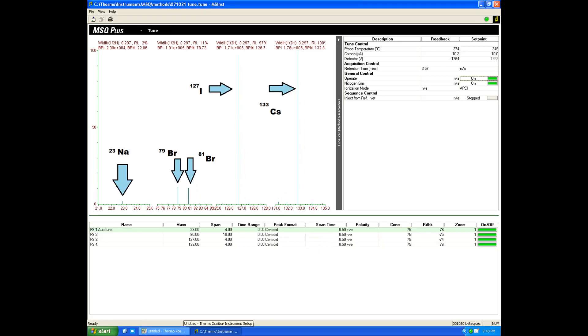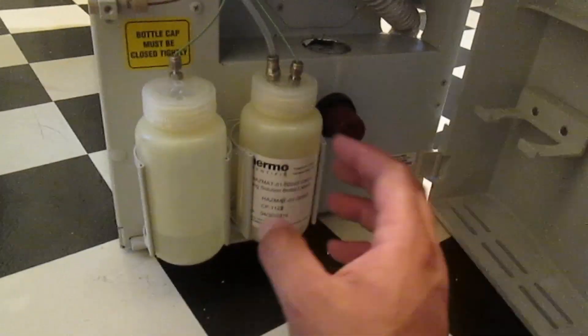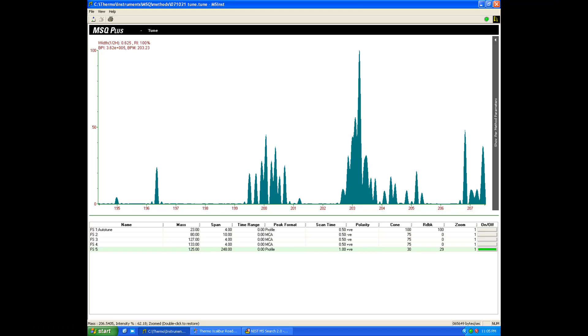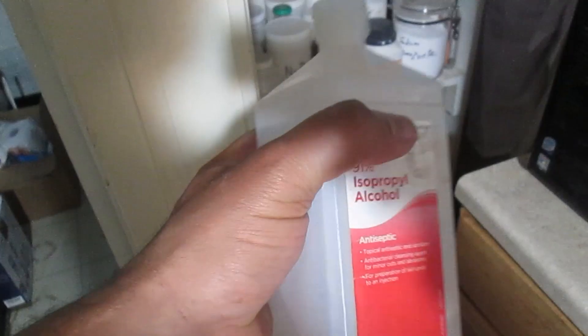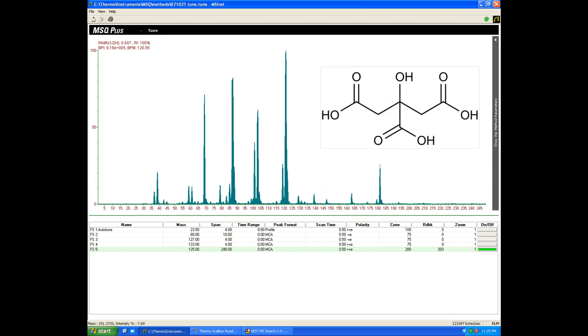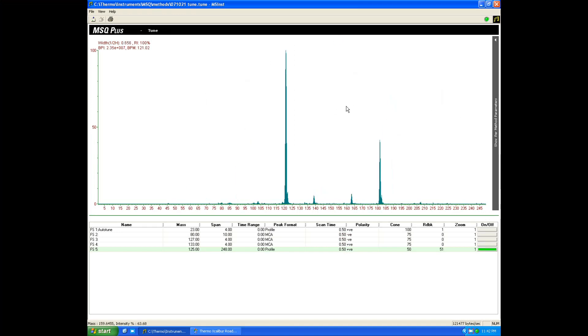Of course, I'm still working on details and fine tuning, but this did not require much work, frustration, or digging for parts like some of my previous projects. I also took a look at another element rich in isotopes — mercury — and the results speak for themselves. Not every isotope was detected, but most of them were in consistent ratio with natural mercury. On the organic side, I tried isopropanol and citric acid with mixed results. But this is still a work in progress and there is much more to be done and explored.